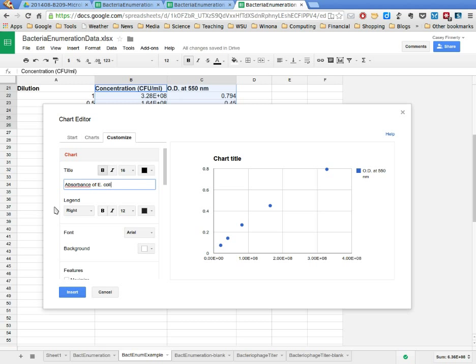You know what? I think a better name for this might be E. coli spectrophotometric standard curve. That sounds a little better. And it's going to be in bold. Now, I don't believe there's a way to selectively italicize E. coli, so perhaps we could go ahead and try that, but I don't think it's going to work. Yeah, it'll italicize the entire thing. And well, what the heck, we can go with that too.